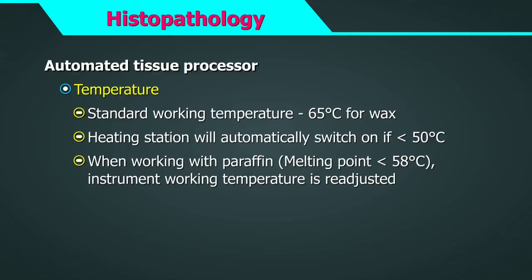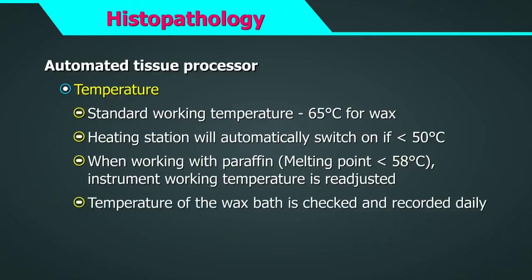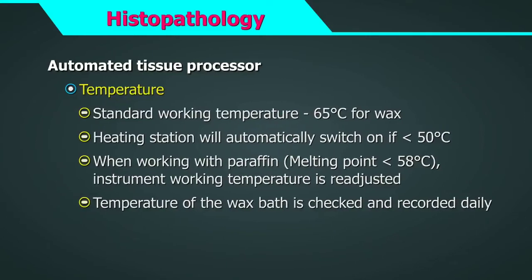If you find that the paraffin does not melt completely after lowering the working temperature, slightly readjust. Resetting after excess temperature shutdown should be clearly understood as per the manufacturer's instructions. The temperature of the wax bath must be checked and recorded daily.